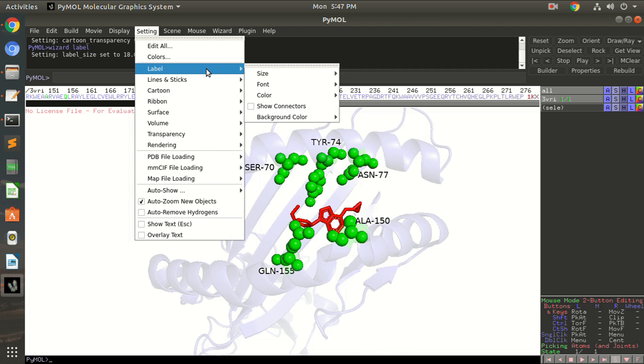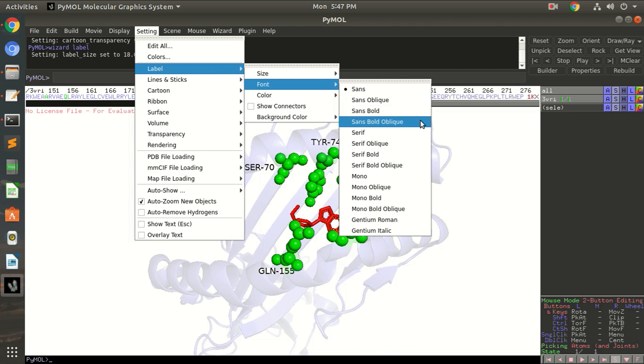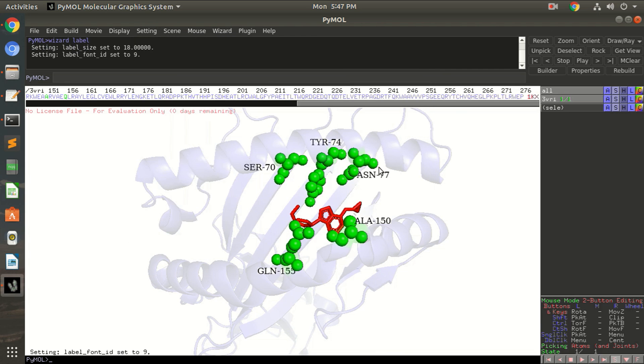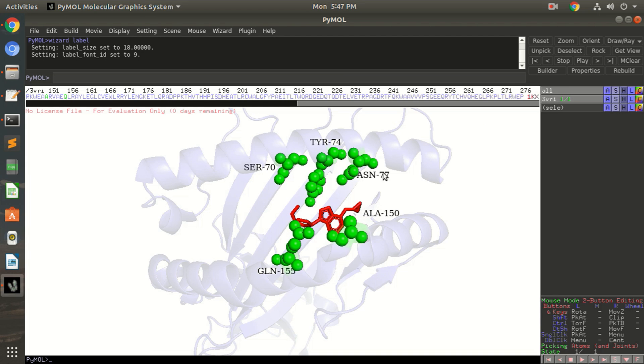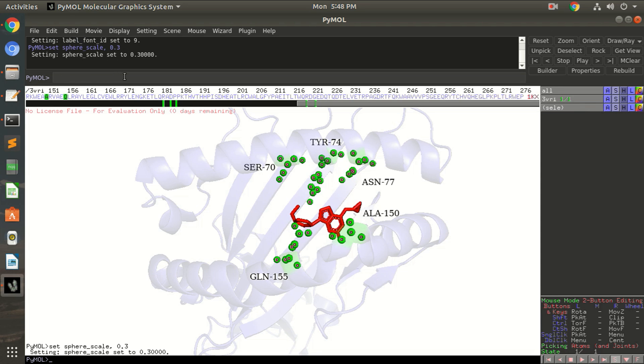If you want to change the font, again go back to setting label font as you want, you want serif. Okay, so you can make them clear as much here. Okay, so if you want to decrease the size of these spheres, set this sphere scale to 0.3 and now they are really reduced in size.